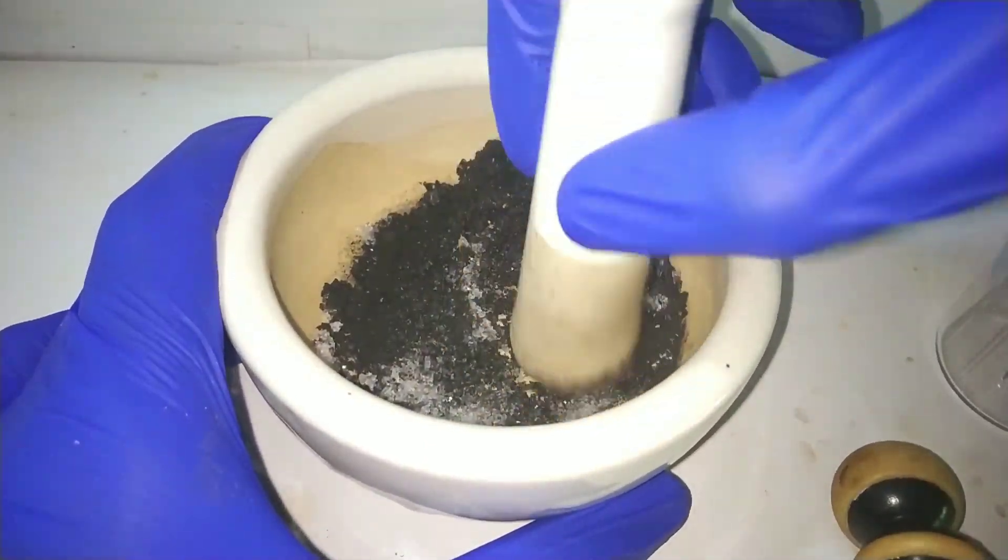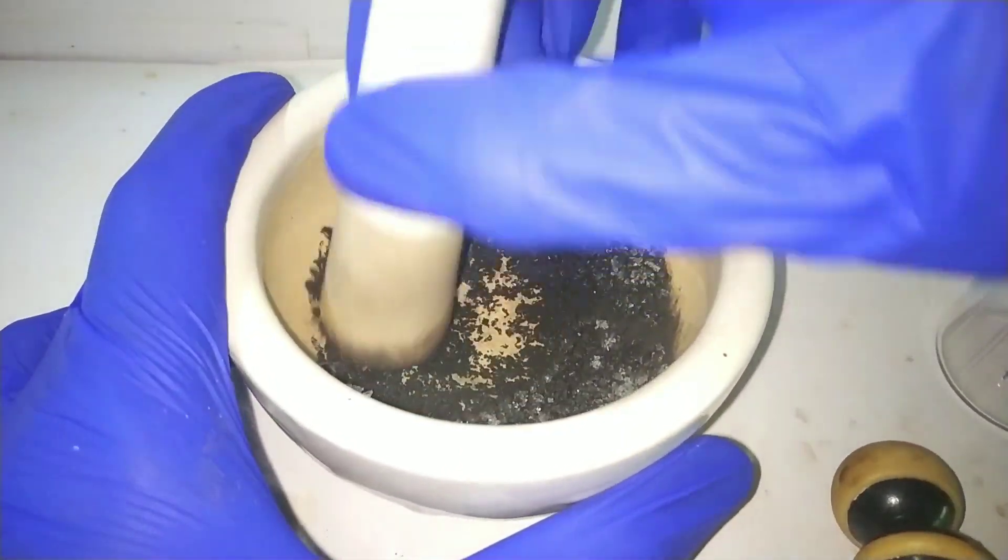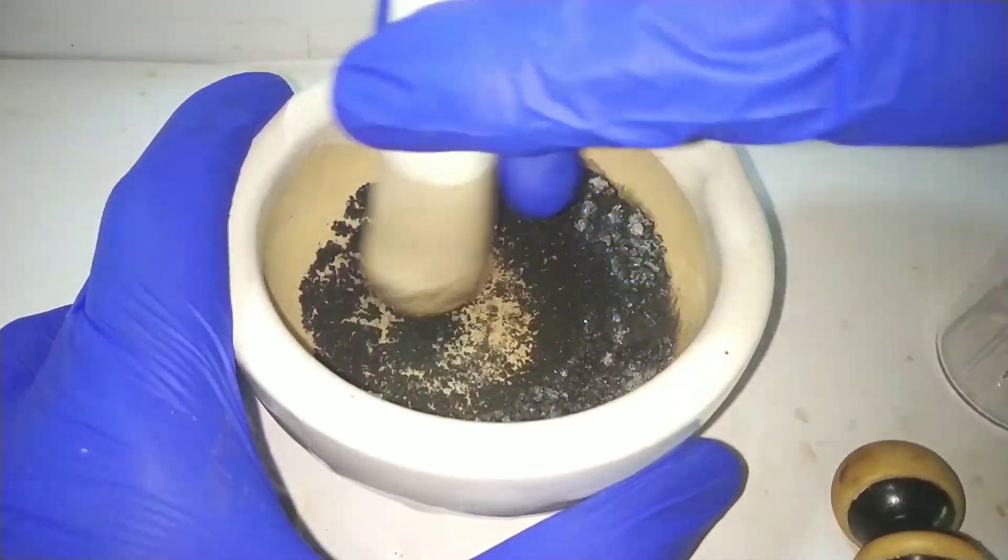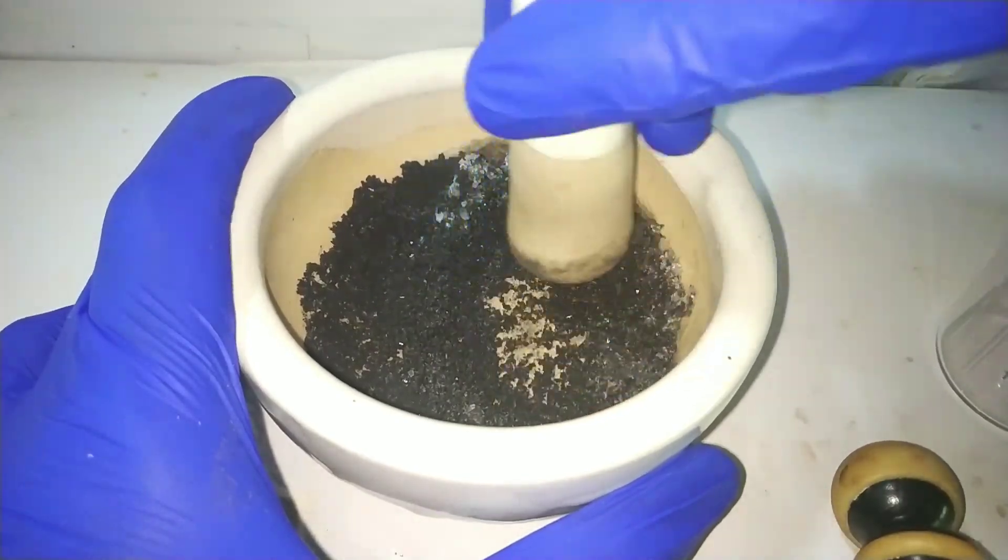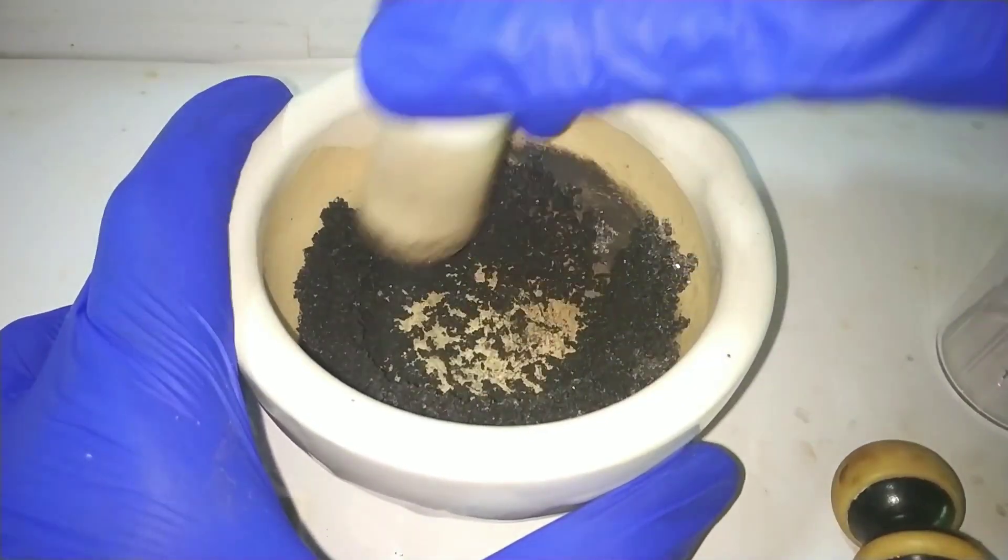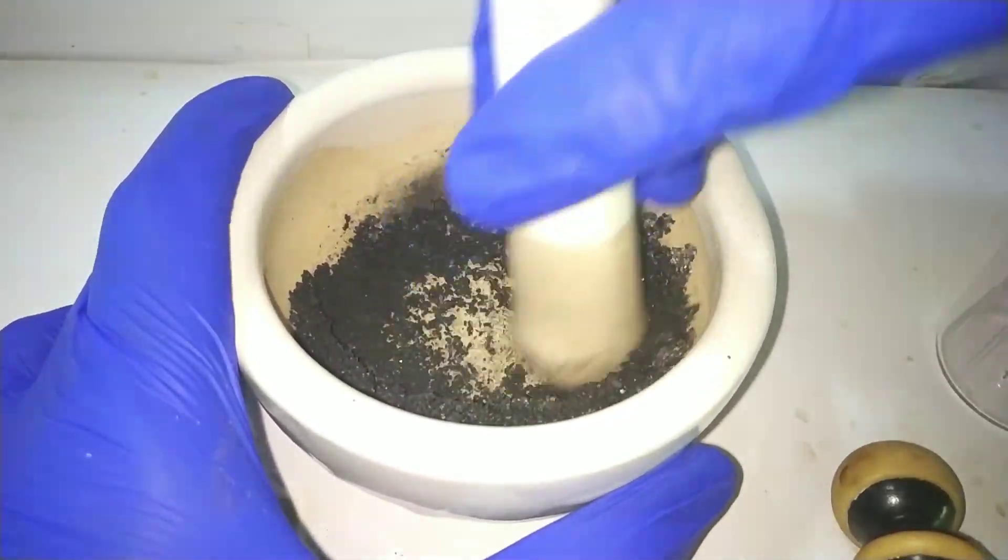With the help of a pestle, grind them together to a uniform mixture which will be black in color due to the manganese dioxide. Grind them by a rotational motion of the pestle and not by ramming the pestle on the compound, as it can cause spillage.